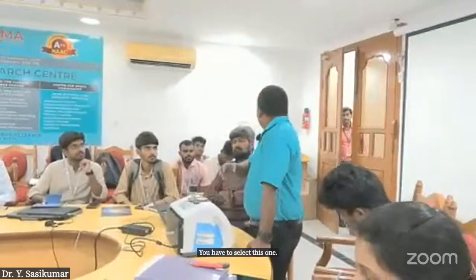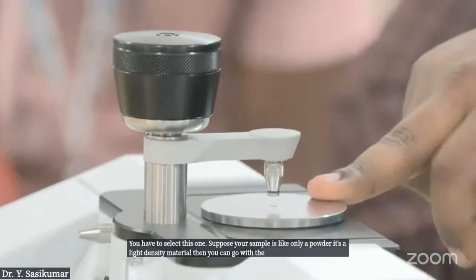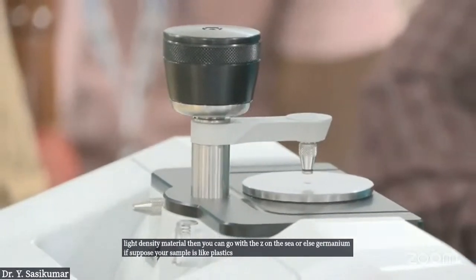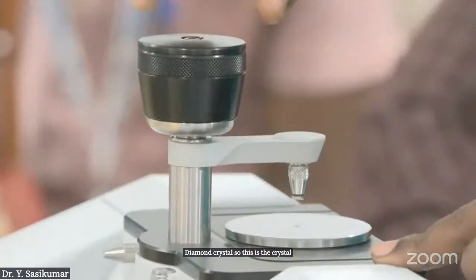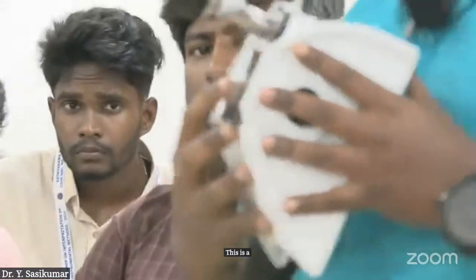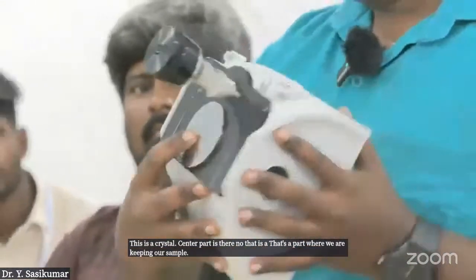Suppose your sample is only a powder or a light density material, then you can go with ZnSe or else germanium. If your sample is plastics or somewhat hard materials, then you have to go with the diamond crystal. This is the crystal, and it is called the anvil actually. The center part is the part where we keep our sample. So, diamond crystal.